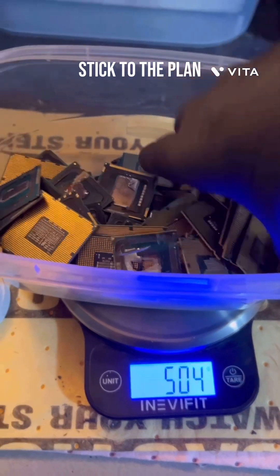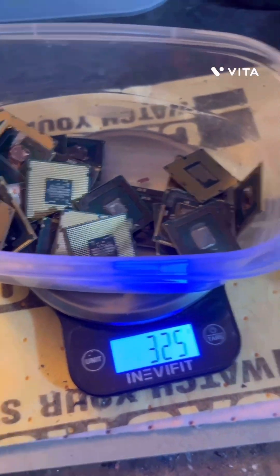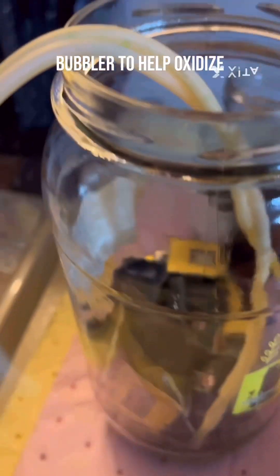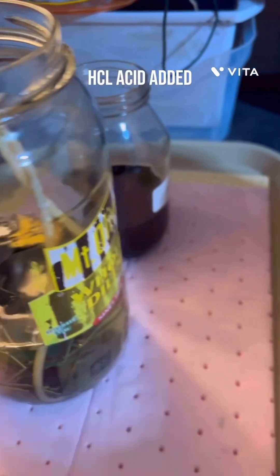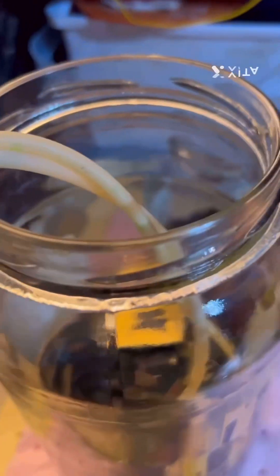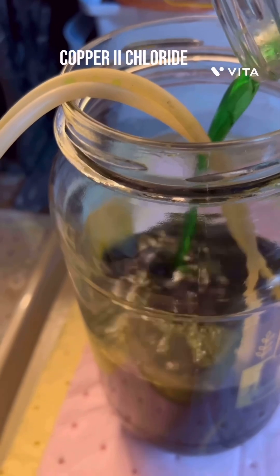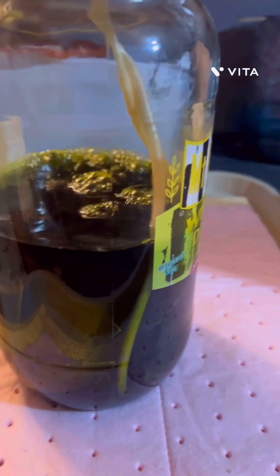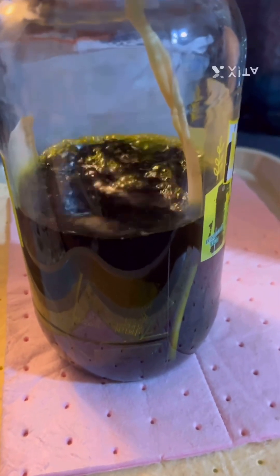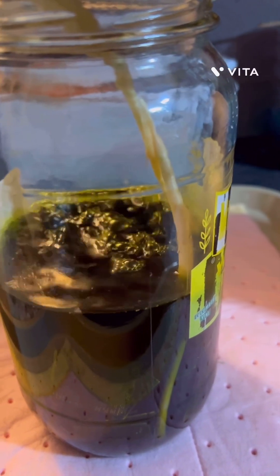We're just going to stick to the plan. We're going to put the chip in here and then put the acid peroxide in here. We're going to cover this with some hydrochloric acid — that's my AP setup. There's 500 grams of chips in there. We're going to use this to attack the base metals and loosen those foils up, and then decant the solution off.